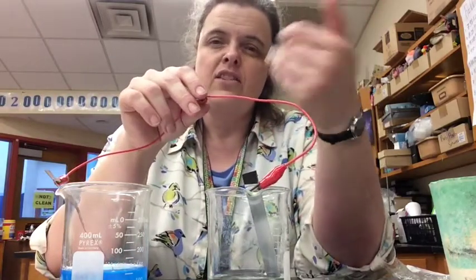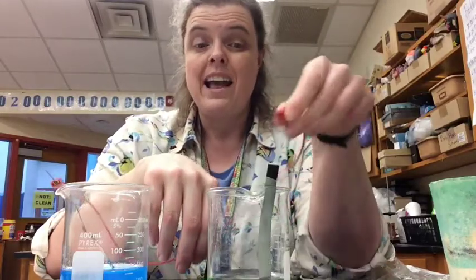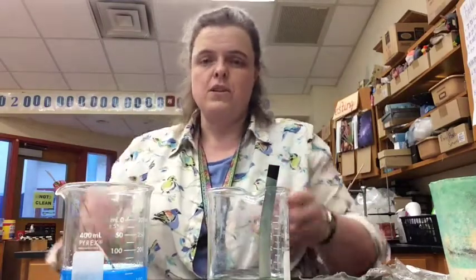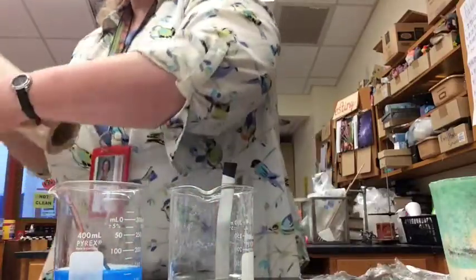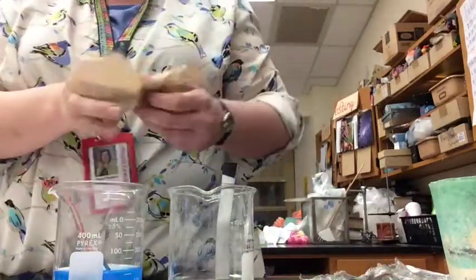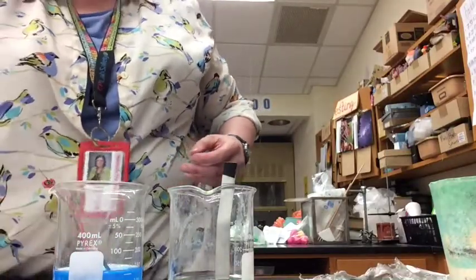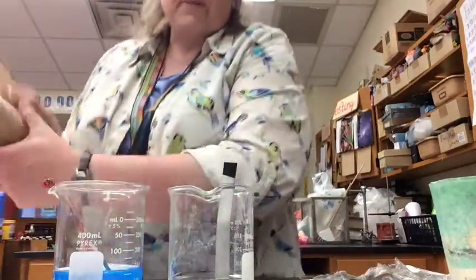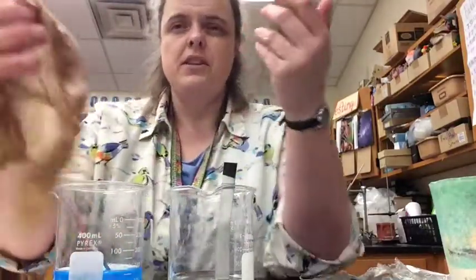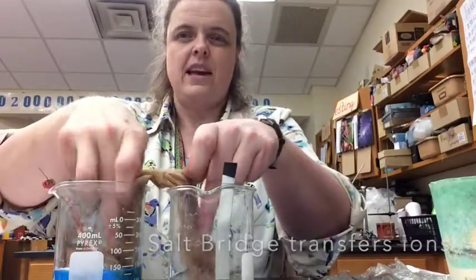Now this isn't enough. You need something else when you're making an electrochemical cell. And that thing you need is a salt bridge. It's a way for the ions to transfer back and forth. So to do that, all we're going to do is take a piece of paper towel, get it a little bit wet, and we're going to provide a bridge for the charges to go through. So here's my bridge. It's just a wet paper towel. I'm going to put it in each side.